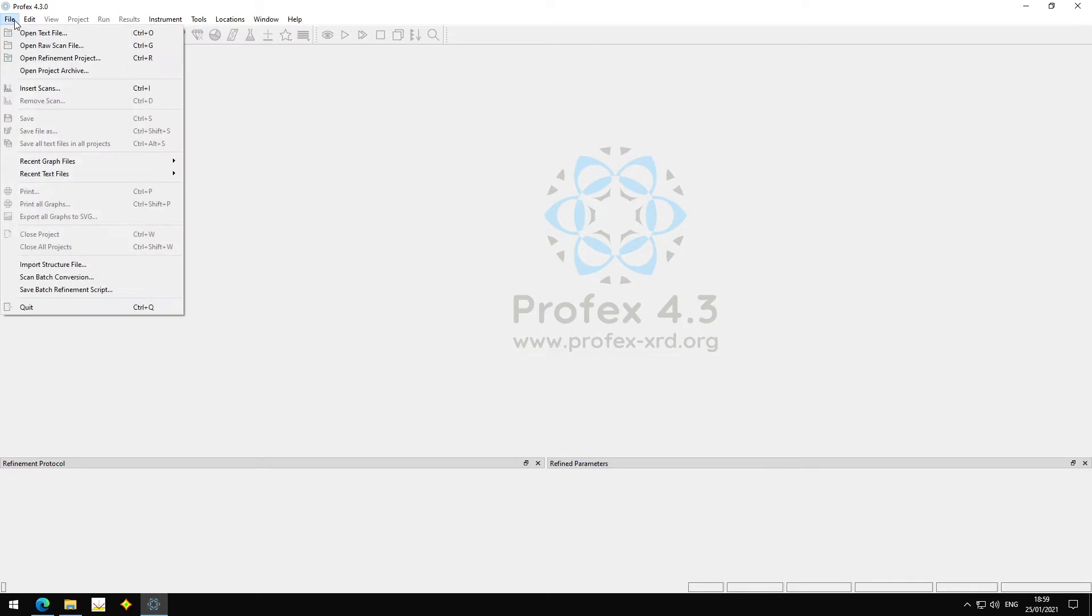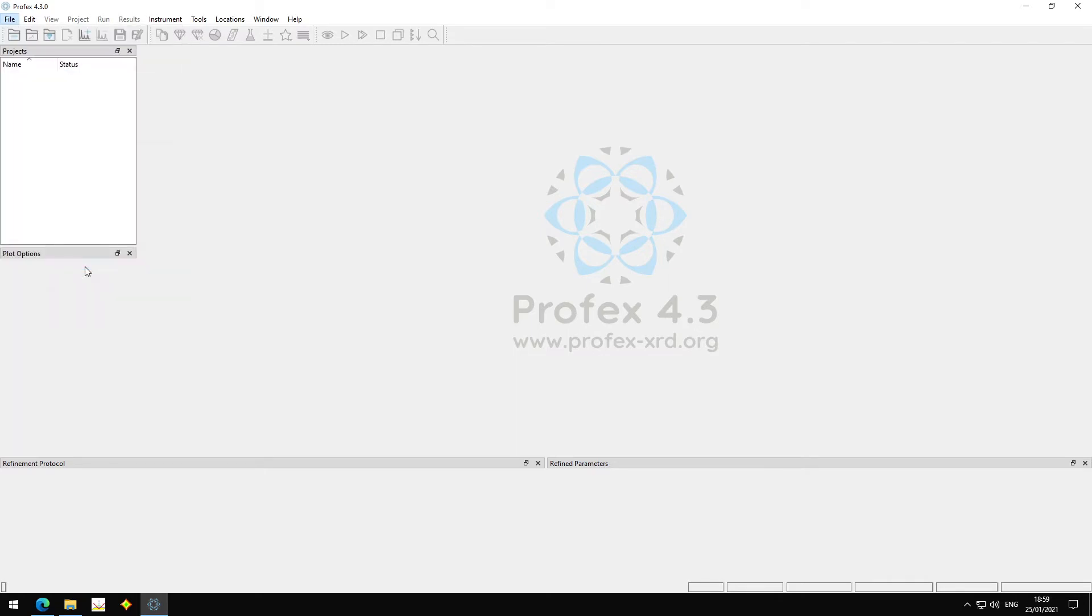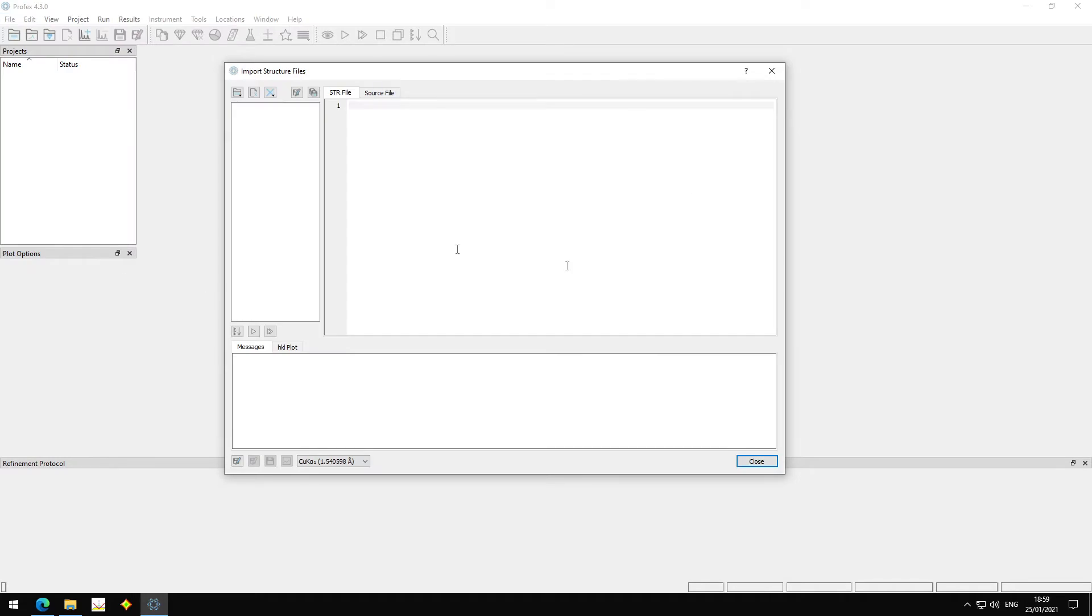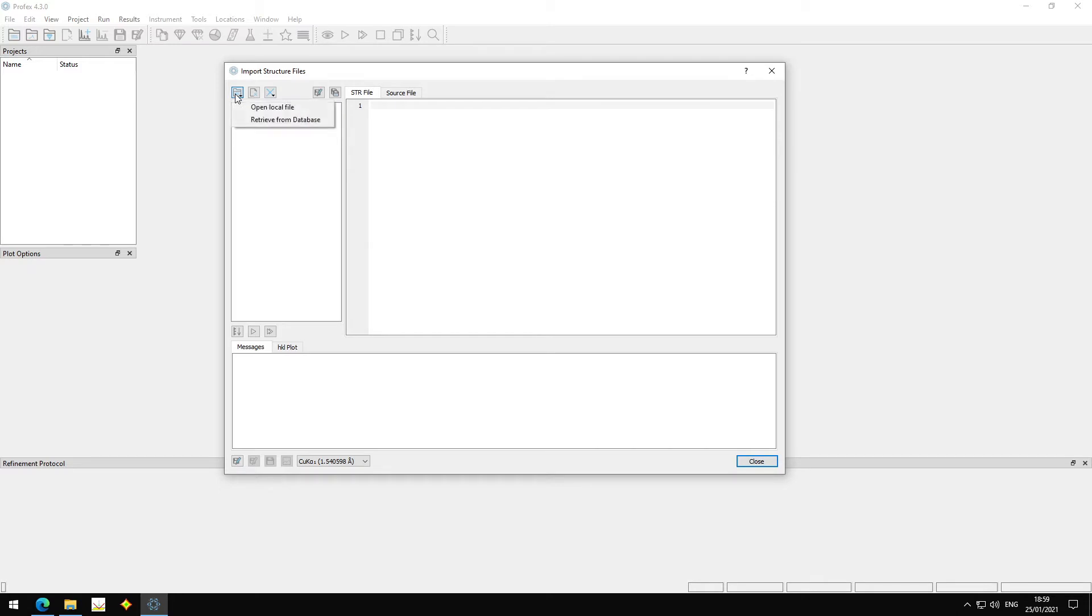Now we go to Profex. And we select File, Import Structure File. This is the normal CIF import dialog. But now if we go to Import File, we get a menu. We can either choose a local file and open the CIF or XML file from the hard disk, the one that we downloaded before, or we can now go to Retrieve Database.